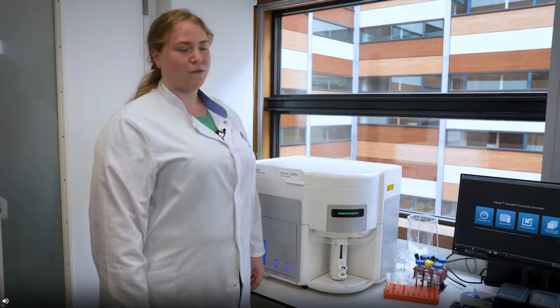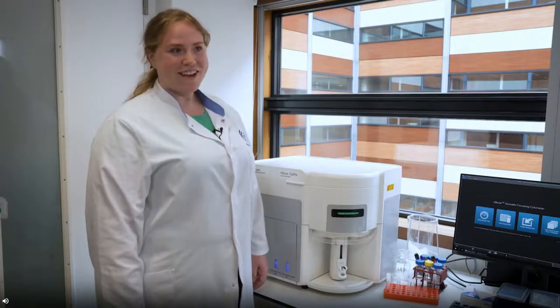Hello and welcome. My name is Cora Chadick. I am the Technical Director at the Amsterdam University Medical Center, location UMC, in the Molecular Cell Biology and Immunology Department. We have a nice wide array of instrumentation here in our core facility at the south of Amsterdam. We have mass cytometers, standard fluorescence flow cytometers, spectral cytometers, sorters. But what I've been really excited about these days is our opportunity to demo and do some testing on the CytPix, the new imaging cytometer from Thermo Fisher.